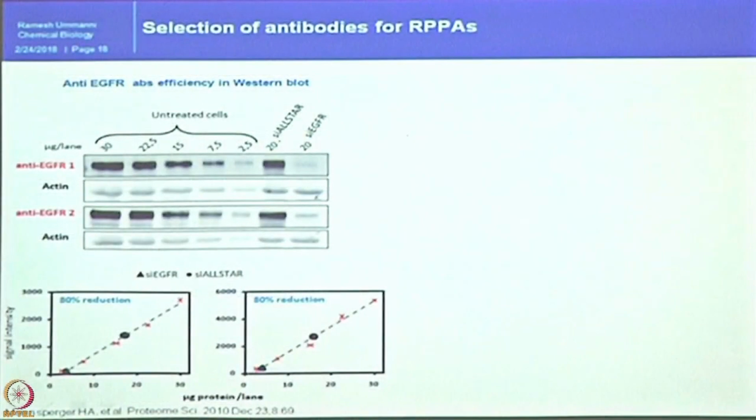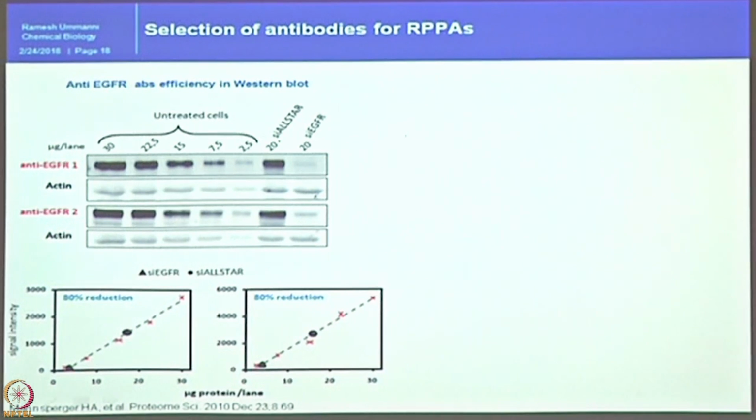At this point, to educate you in a different way, not all antibodies against one target will behave the same way. Let us say, for example, if you search the Cell Signaling website for an EGFR or phospho-EGFR antibody target, you will have 10 different antibodies with different catalog numbers. That means they are from different clones or different monoclonal antibodies, and not all the antibodies behave in the same way. How is that? Now, look at this picture.